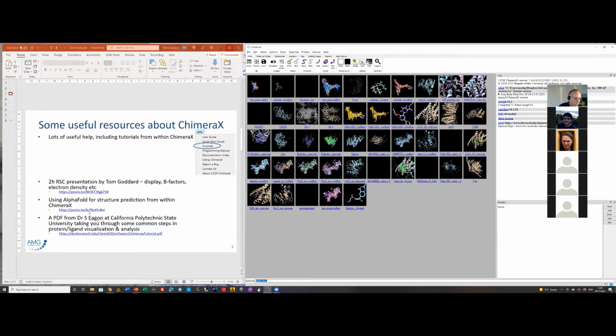There's a nice short video on using AlphaFold from within ChimeraX to do your own structure prediction using the AlphaFold code, which is possible within the current versions based on a sequence that you give it. If you prefer to follow along with PDFs rather than videos, there's a nice PDF here which you can also take a look at. So plenty of help online.